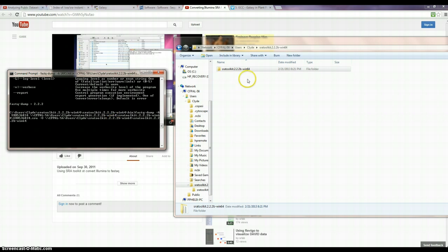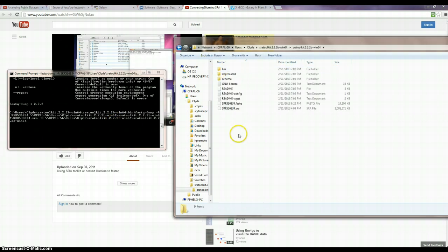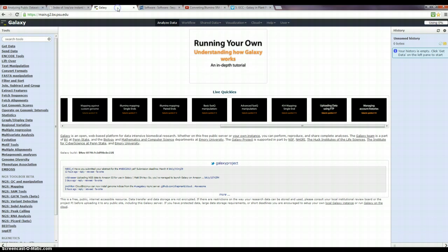Now when we hit it, and we come back over here, we already have our FASTQ, and it's 19,200 kilobytes, so 19 meg. So I may need to learn more about exactly what it's doing, where we go from 2 gig to 19 megabytes. But anyway, just wanted to get this recorded before I forgot how to do it. So this would be the file now, the FASTQ, that we would use in Galaxy following the instructions in these instructional videos.